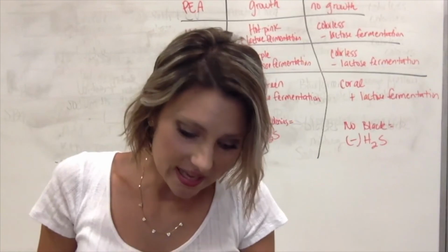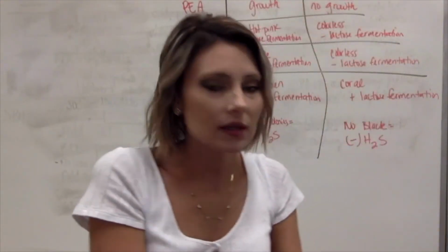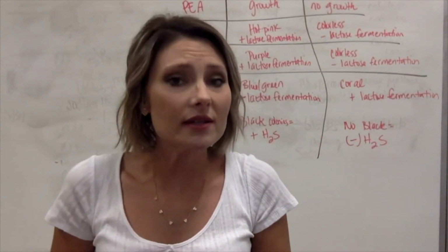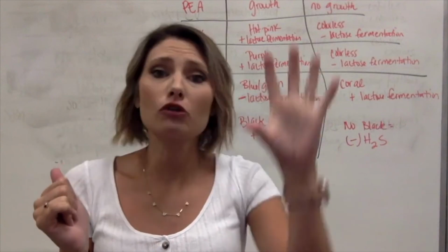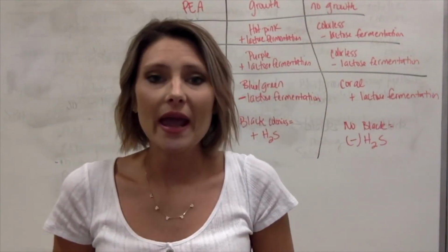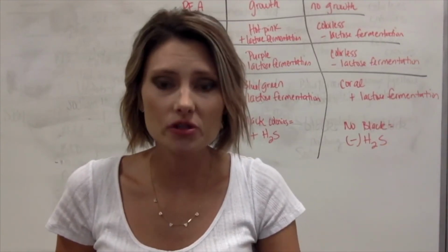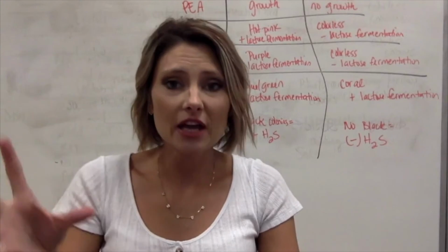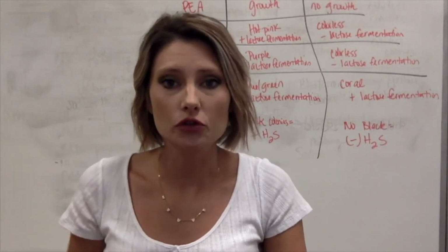So that's it for these results for your selective and differential media. I know it's lots of colors, lots of things to remember, but if you try and group these in your mind into groups that are alike, I know that always helps me. And try not to just memorize colors. Try to memorize the pH indicators, and then that will help you to remember what colors things are turning.